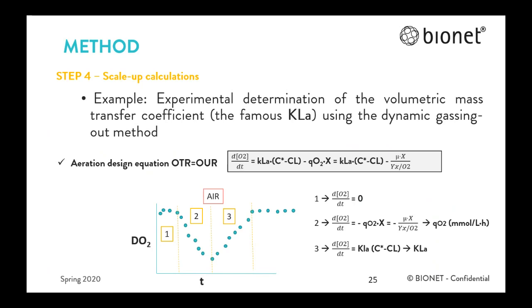Several methods have been developed to determine the oxygen transfer rate in bioreactors, chemical and physical, but so far, the most common and simple method used is the physical dynamic method, based on the measurement of dissolved oxygen concentration in the liquid during the absorption or desorption of oxygen in the solution. In the dynamic method, the liquid is deoxygenated by stripping the oxygen with nitrogen. Then, the dissolved oxygen concentration in the liquid is measured until equilibrium is reached.